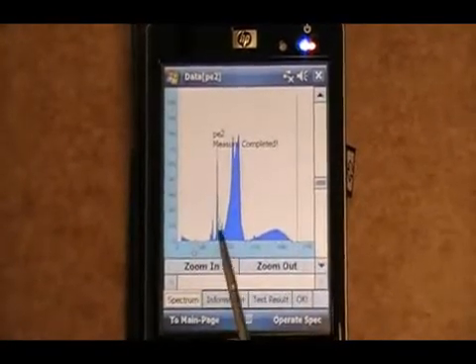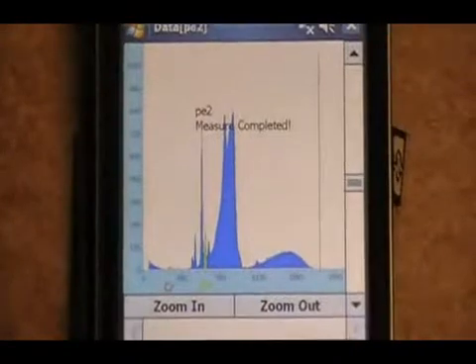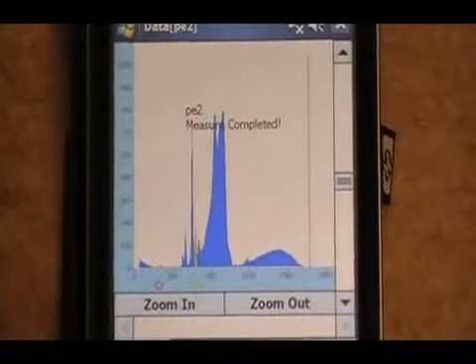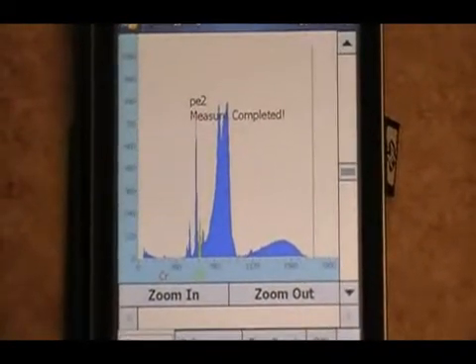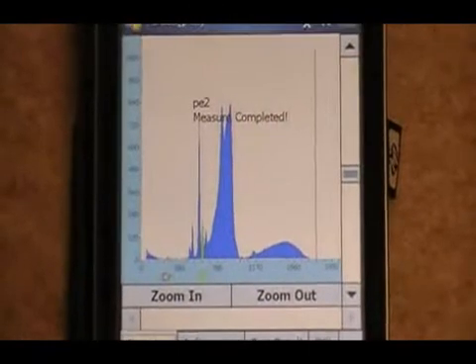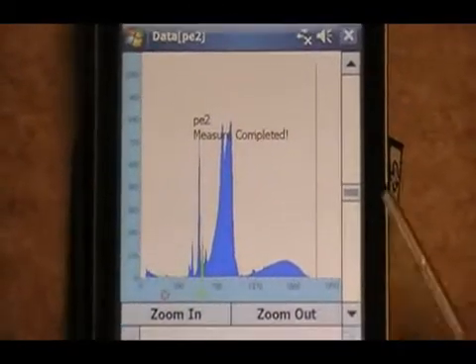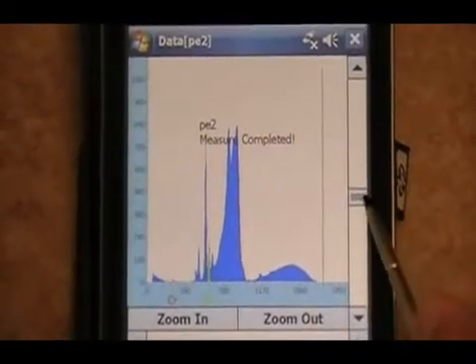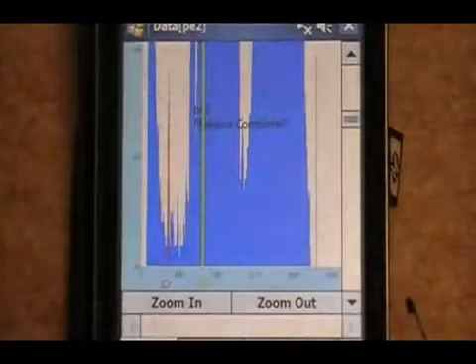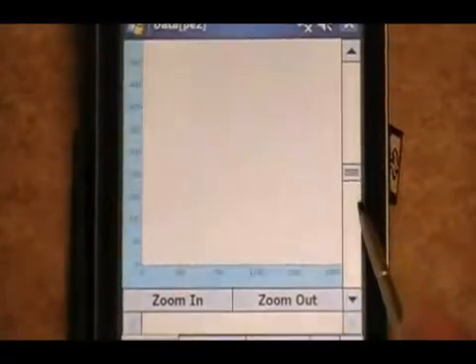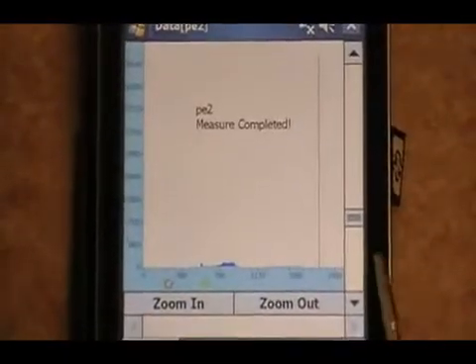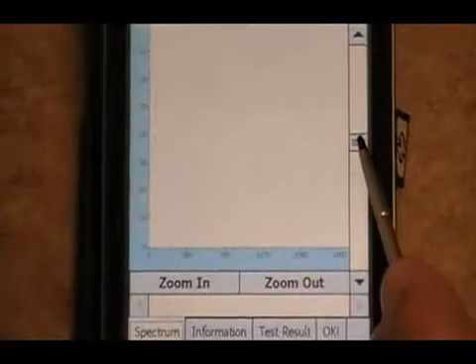And there's the lead peak. So this way, the person can highlight each element to make it easier for them to see just how much is there in the matrix. You're also able to increase the intensity of the matrix and decrease it to better view that specific peak.